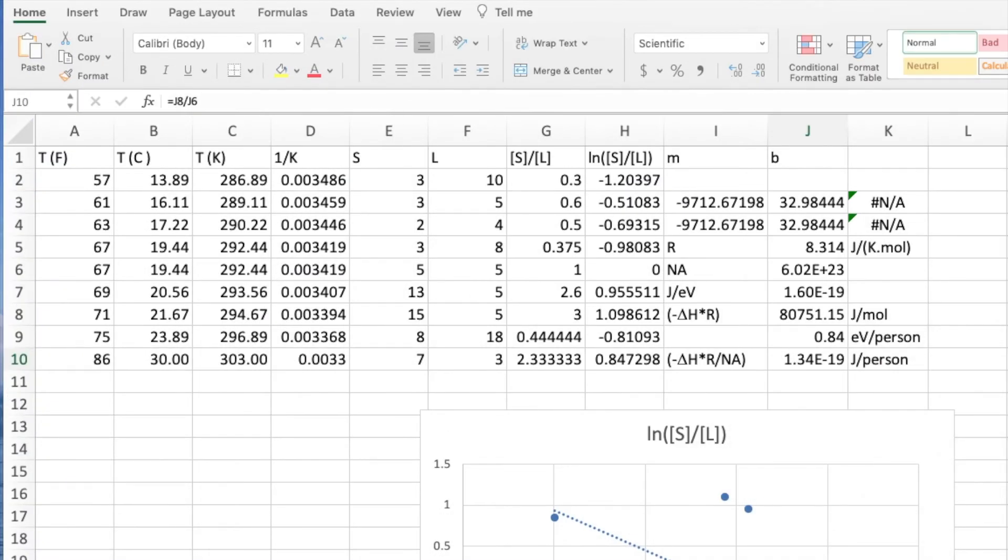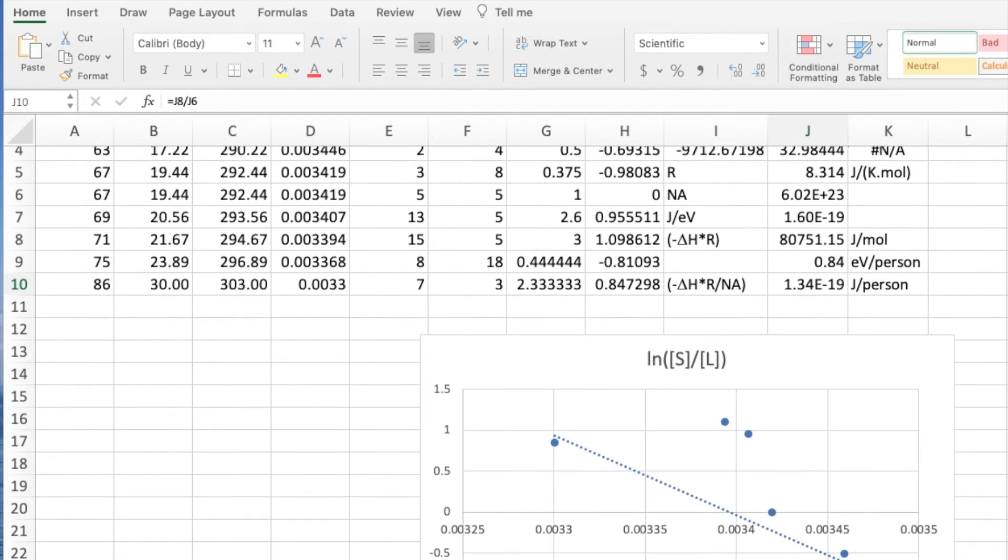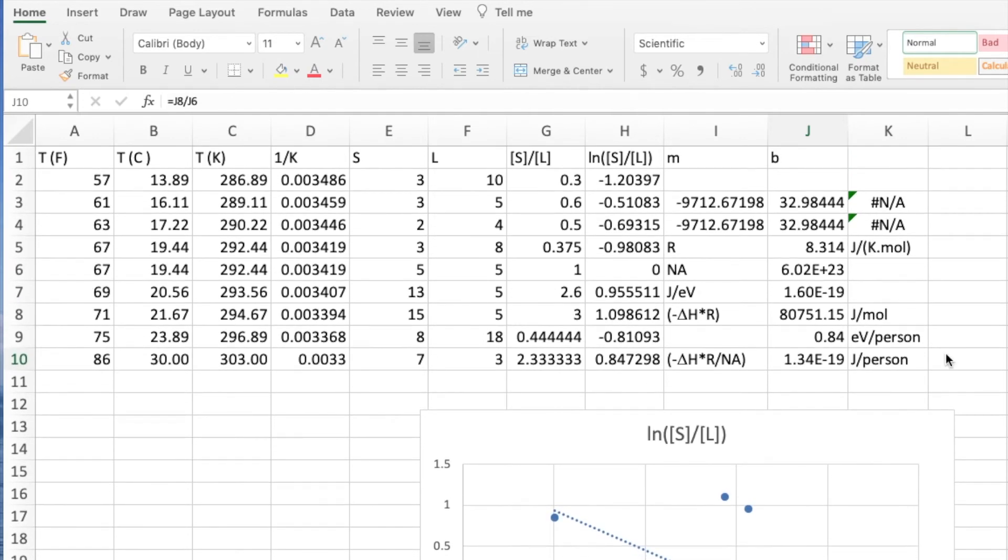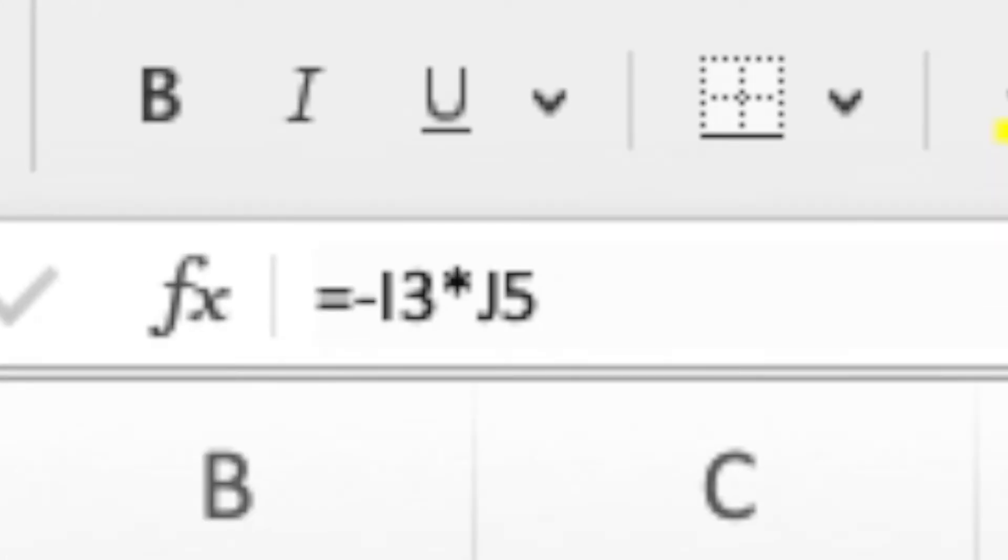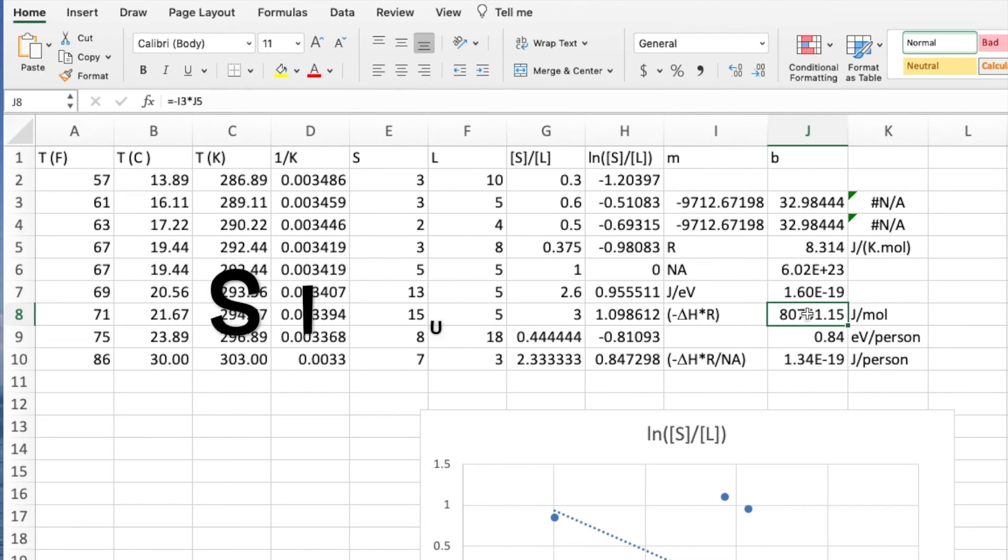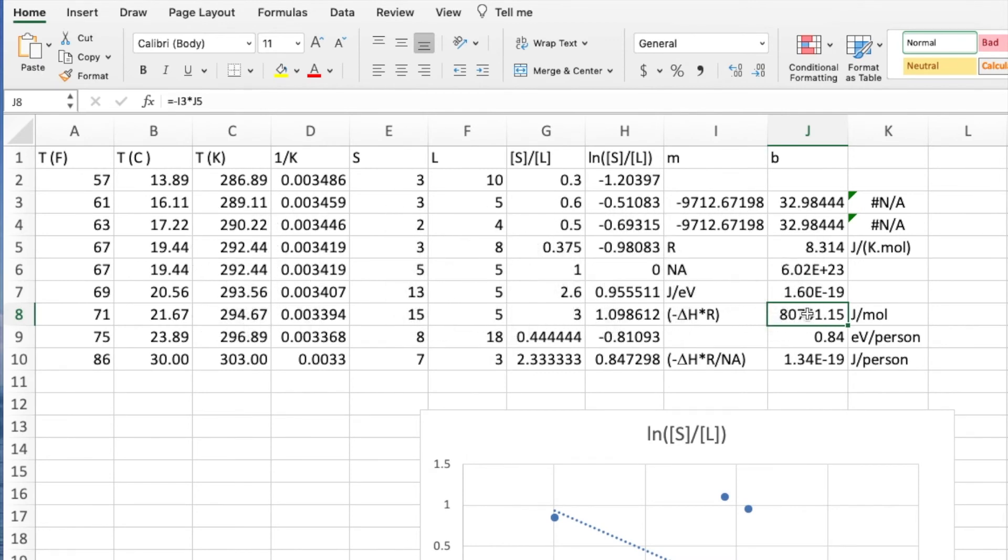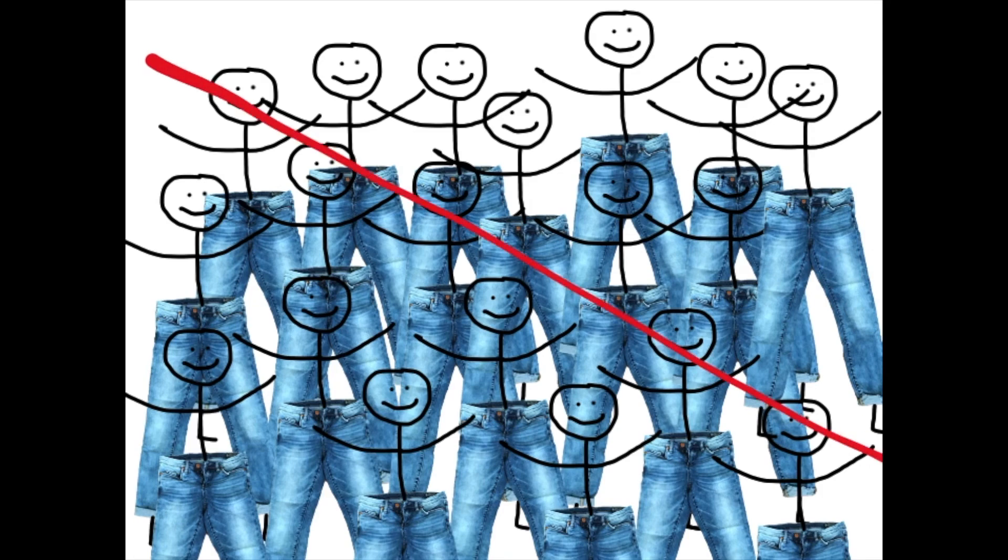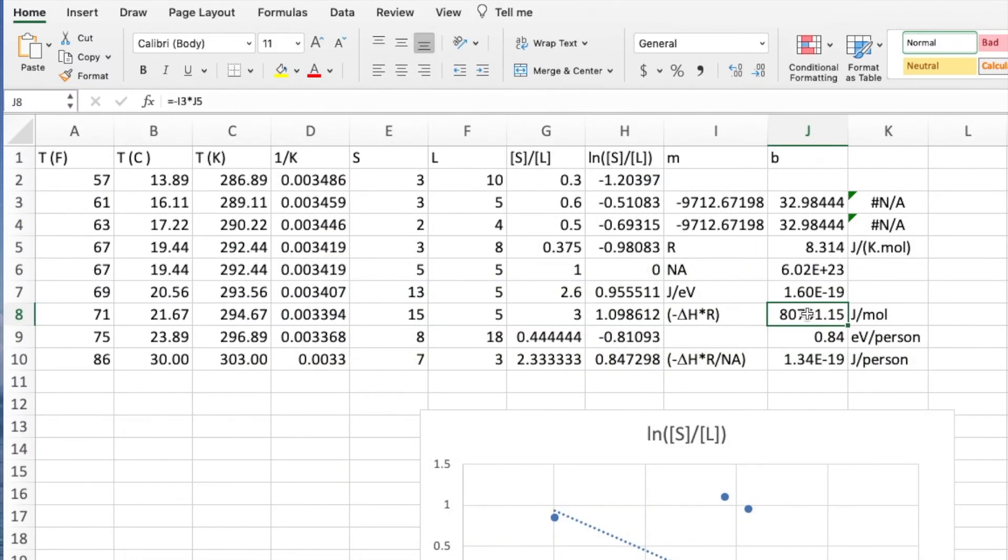Now that you are back, here are the results. Multiplying the slope by minus the gas law constant yields the enthalpy change. That's done in cell j8 here. I suggest that you use SI units. This result is in joules per mole. That's silly. Nobody deals with humans in molar quantities. Dividing by Avogadro's number produces the result in joules per person. That's done in j10 here.